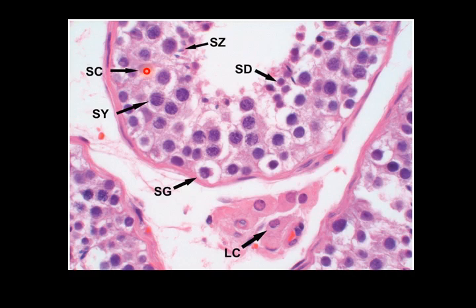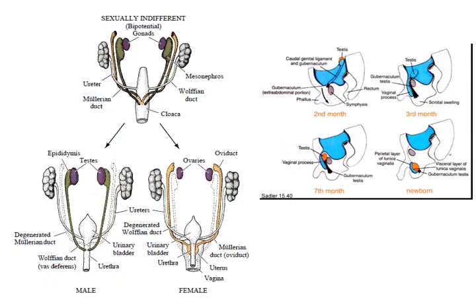And there's a second population of non-germ cells, the Sertoli cells, which are designed to hold the maturing germ cell elements together and encourage their maturation from immature through to mature germ cell elements. Again, here's these Leydig cells in the interstitium that are associated with the androgen production.